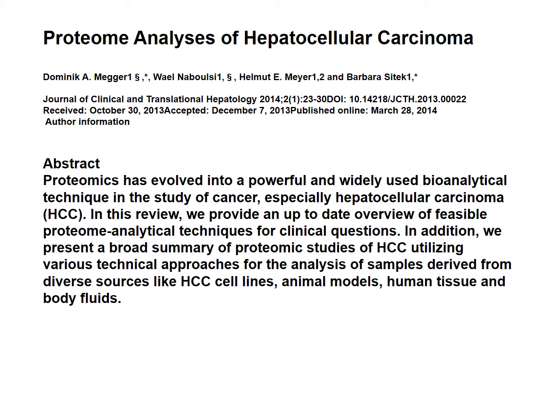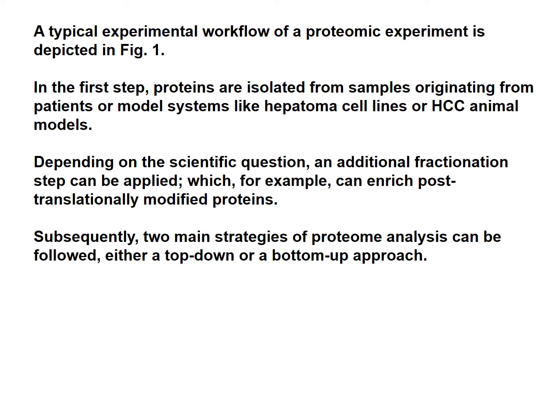And this is a pretty good paper. It looks at studying cell lines, animal models, human tissue, and bodily fluids from patients. So it's a very broad approach using proteomics to look at all these sources of information here.